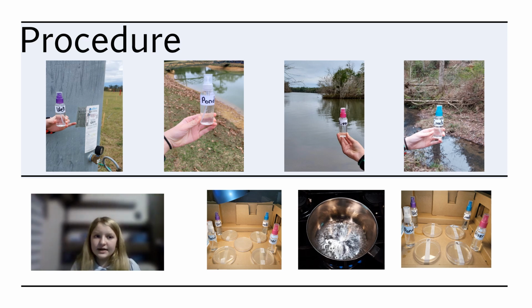After 3 days of incubating, I take the water samples out of incubation and observe the growth on each plate. I analyze and take my results, then move on to the last part of my project. I boil each sample for 3 minutes, then repeat my actions with the first round of samples. After 3 days of incubation, I compare and write down my results and conclusions from my testing.